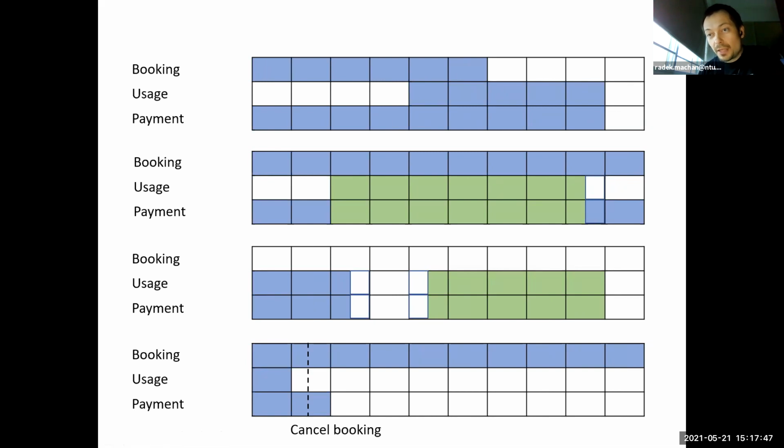Because on each of the computers at the microscope, there's also a usage tracker, which is basically a program where you need to log in with your PPMS account, and that is linked to the PPMS booking system. So in this way, the booking system knows when which user is using the equipment.